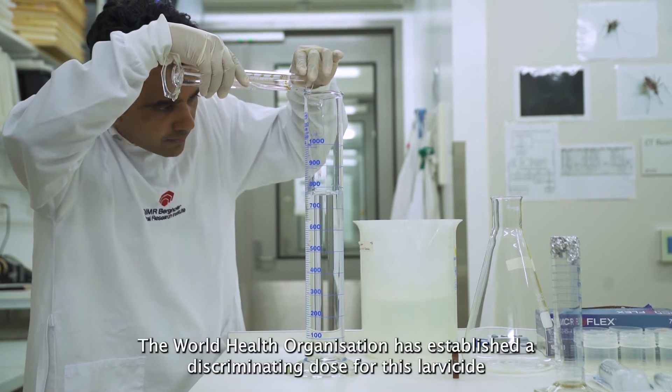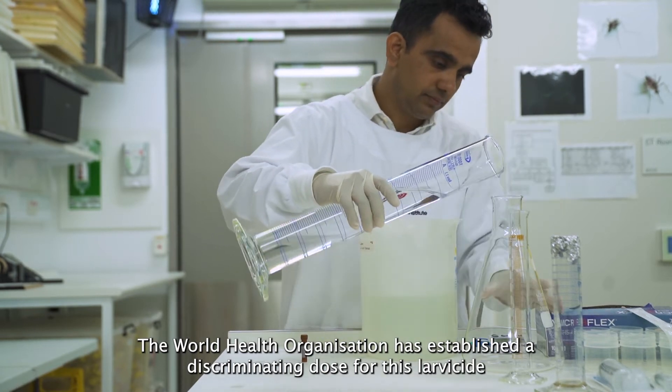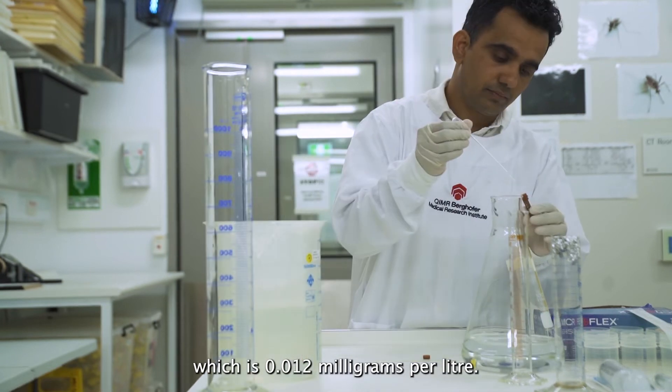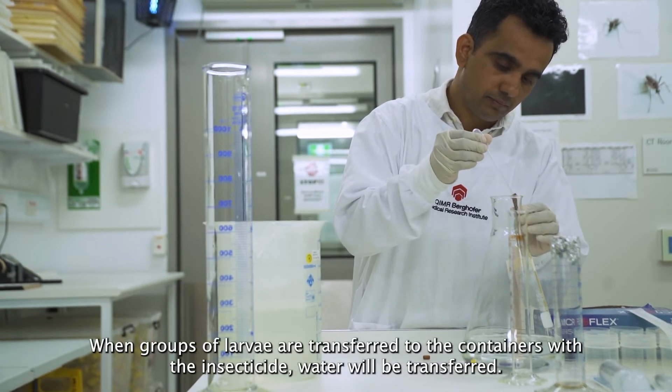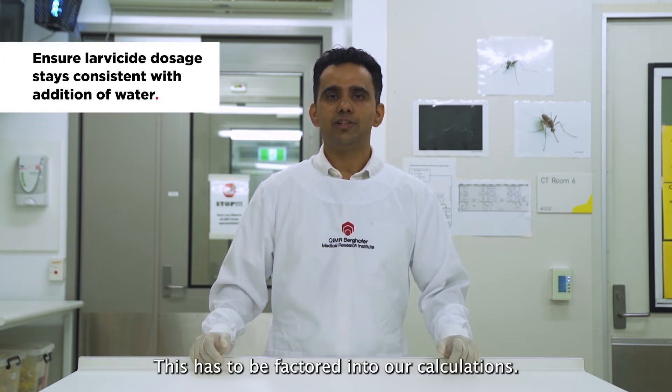The World Health Organization has established a discriminating dose for this larvae size, which is 0.012 mg per litre. When groups of larvae are transferred to the containers with the insecticide, water will be transferred. This has to be factored into our calculations.